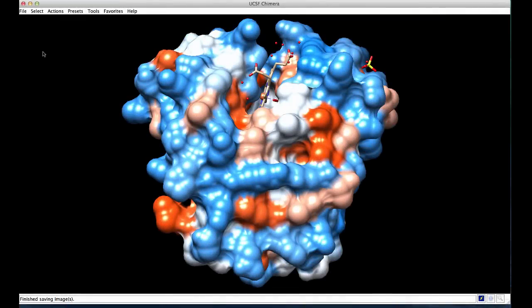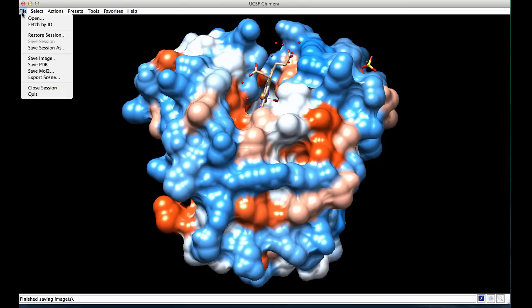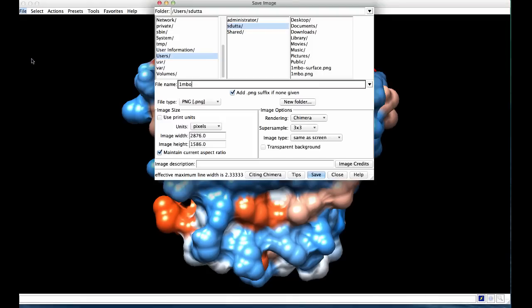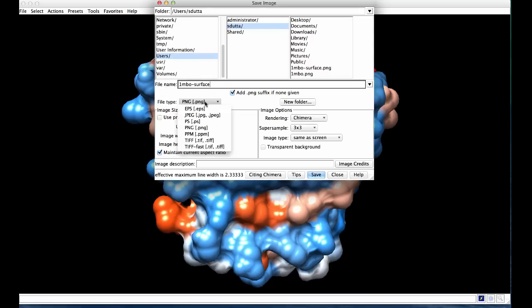To save an image from the graphics window, click on the file menu, save image, provide a name for the file, select the file type to save the image, and save the file.